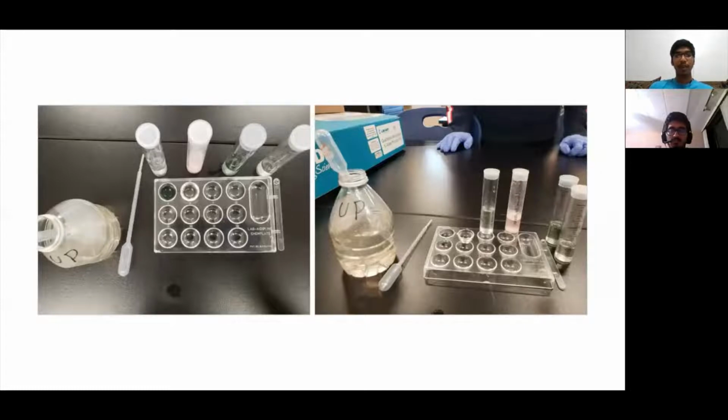And then in the template, the area next to it is clear because the test for chlorine was negative. The test for chromium on top in the calibrated tube, the first calibrated tube, was negative. Next to it is nitrates, which was light pink. And what that means is there was nitrates present, but in a very low quantity.